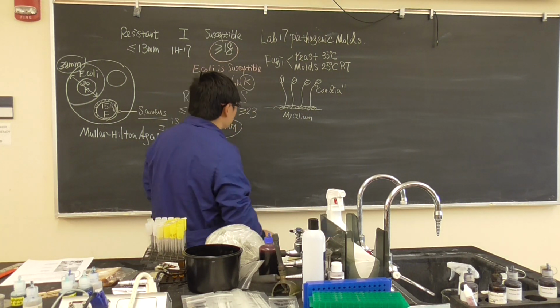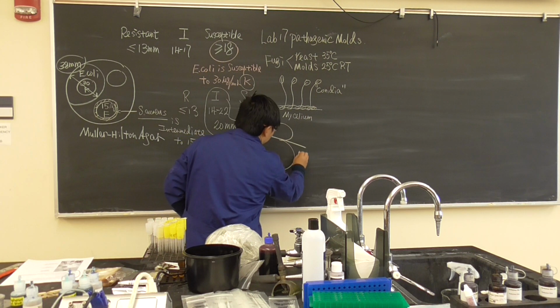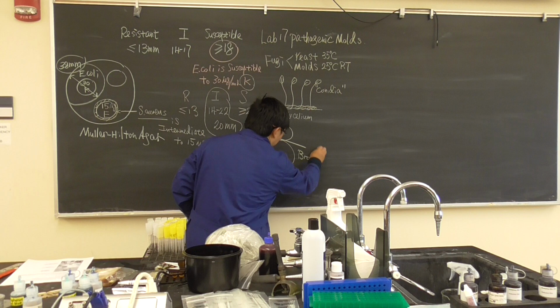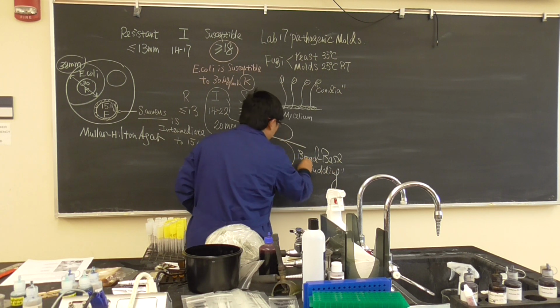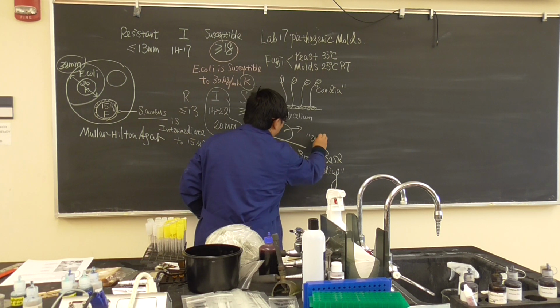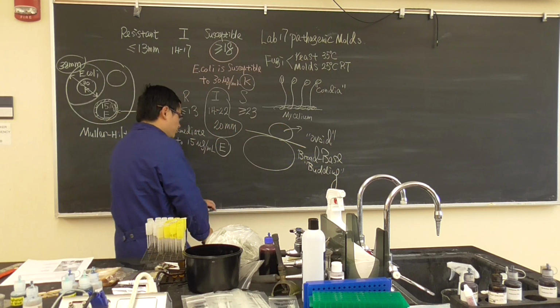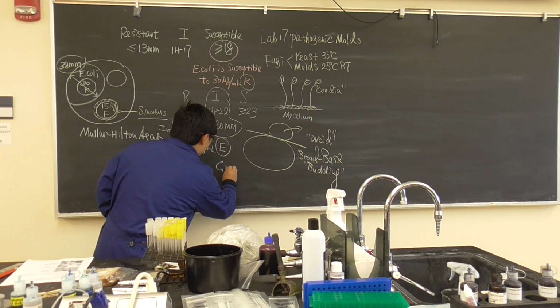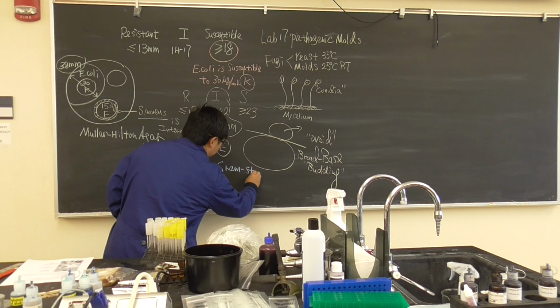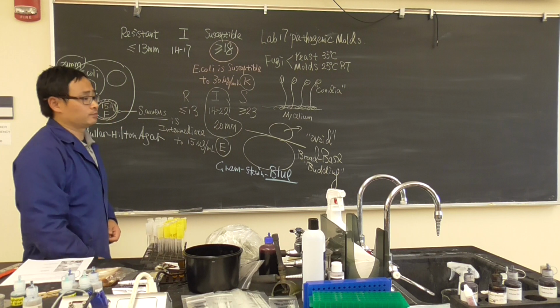Now, how do fungi generate a daughter cell? It's called a broad base bud. That's the key to how they generate a daughter cell. It is released like an ovoid, so we call it ovoid. And if we do a gram stain, it is all gram stain blue, so we don't say it's positive or negative. It is all gram stain blue.